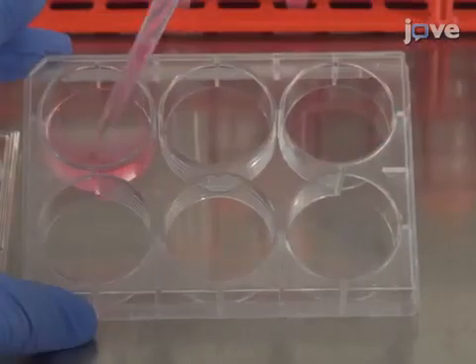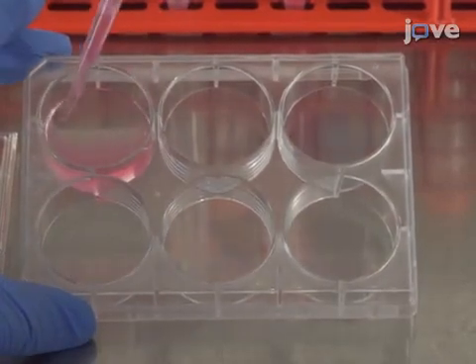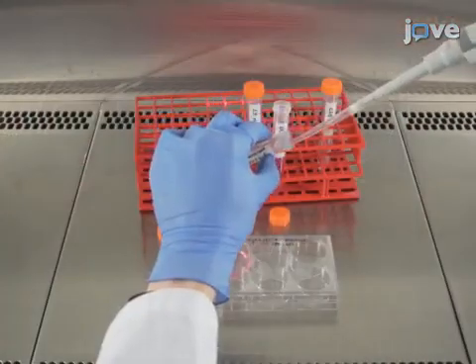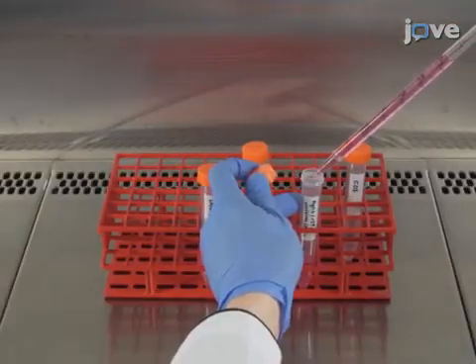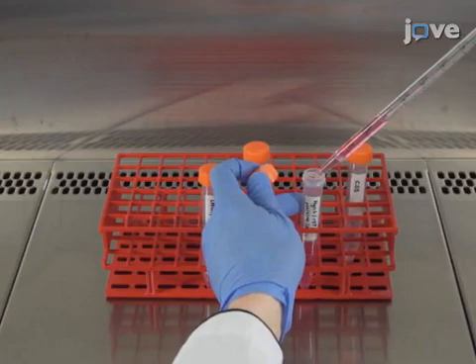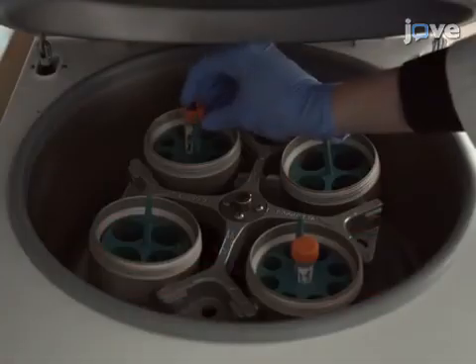Gently suspend the cells with a 1000 microliter pipette and transfer them to a 15 milliliter tube. Afterward, add 7 milliliters of DMEMF12 to the cell suspension and spin the cells at 200 times G for 5 minutes.